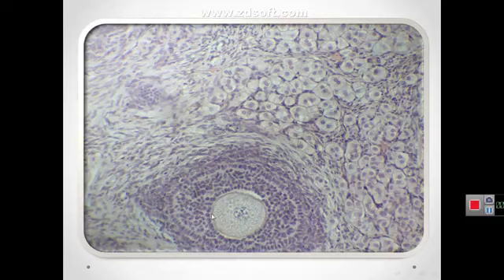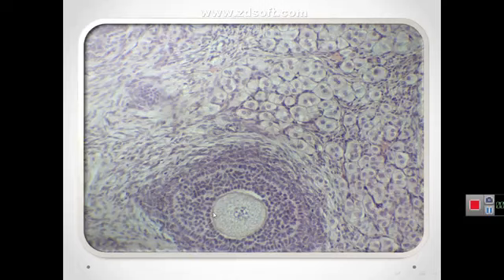Between the oocyte and the first layer of granulosa cells of the growing primary follicle, extracellular material accumulates as the zona pellucida, containing four glycoproteins secreted by the oocyte. This follicle is a multilaminar primary follicle.